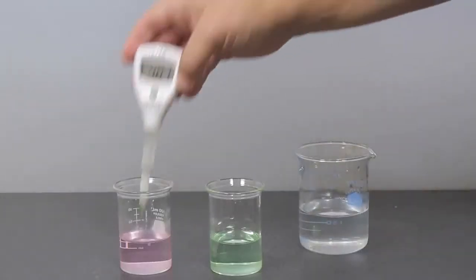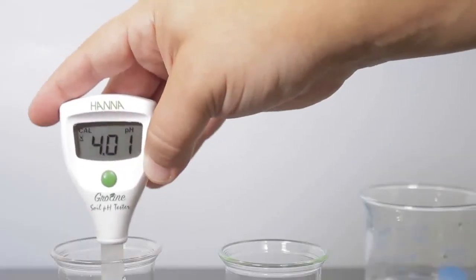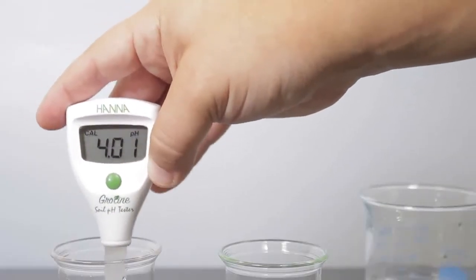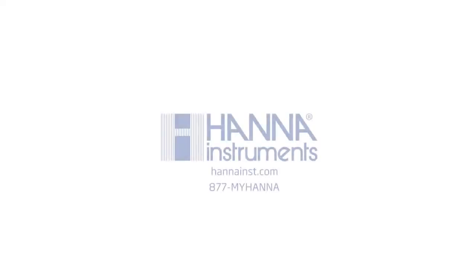Rinse the electrode again and place the tester in your pH 4.01 buffer. Once the second calibration point is stable, STORE will appear on the screen, confirming that the two points are recorded, and it will return to measurement mode.